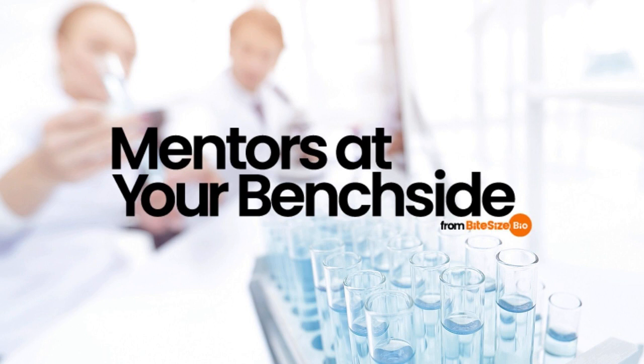Perhaps you plan to weigh out 200 grams of dextrose for your weekly experiments. You might go ahead and add dextrose with a scoop until the scale reads 200 grams. How often do you think about how close the scale is to reporting the true mass? It could be the scale is out of calibration and the actual mass you're adding is closer to 196 grams. In other words, how accurate is your measurement?